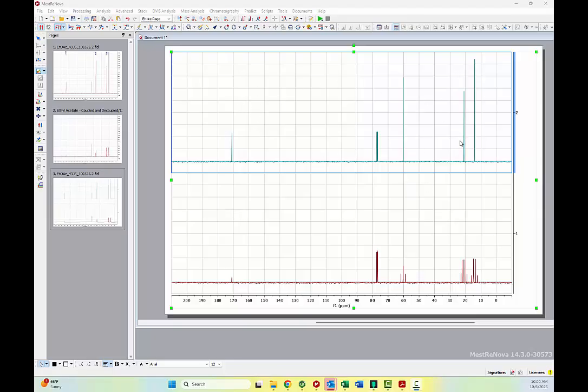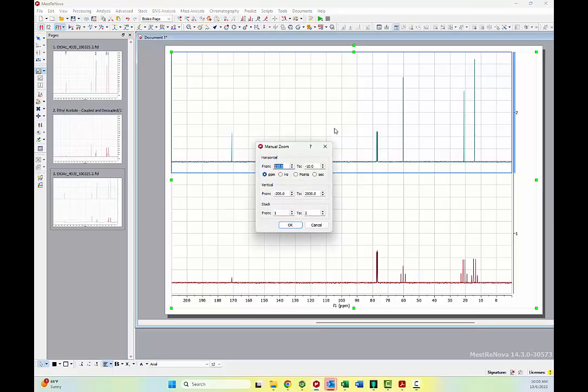especially because of how long it takes to collect C13 spectra. A standard proton NMR can be collected in about 50 seconds. 8 scans is more than enough in order to see all of your proton information, whereas for a C13, you usually need 64 scans, 128 scans, 1024 scans, and so we're talking about 5-minute, 10-minute, hour-long experiments instead of 45 seconds. And so in practice, we just choose to collect the C13 spectra this way, and we get the information more effectively, sooner.